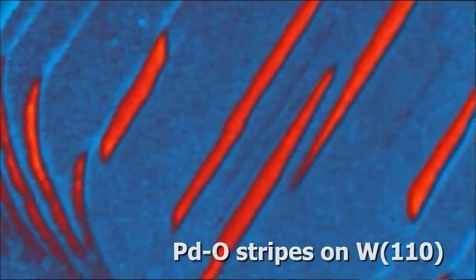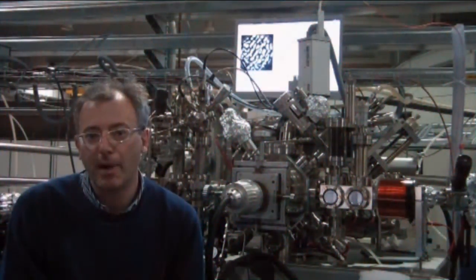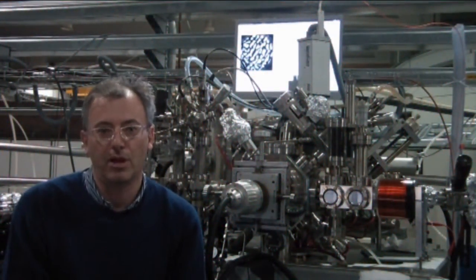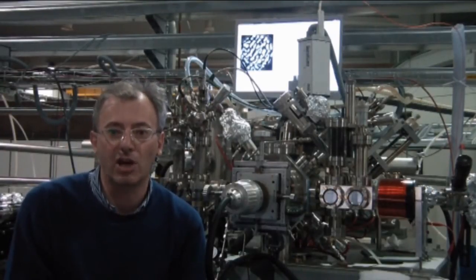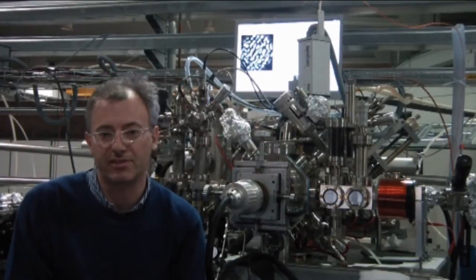Now combine LEEM with micro-LEED and you will be able to monitor the evolution of surface structure from the atomic scale to mesoscopic wavelengths.